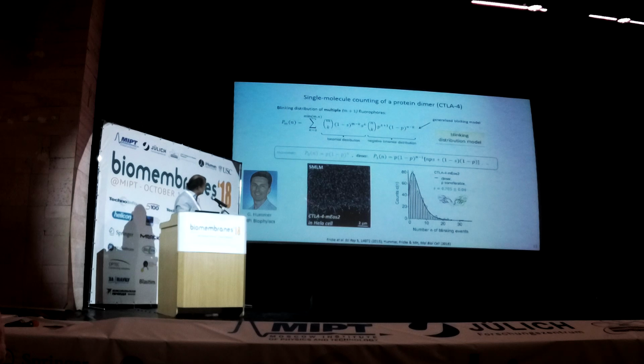So we imaged this protein fused to the MEOS2 protein in the HeLa cell. We recorded the blinking distribution. We can fit it very well, and we extract, indeed, it's a dimer to 100%.